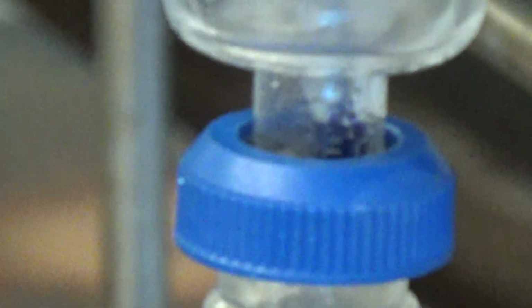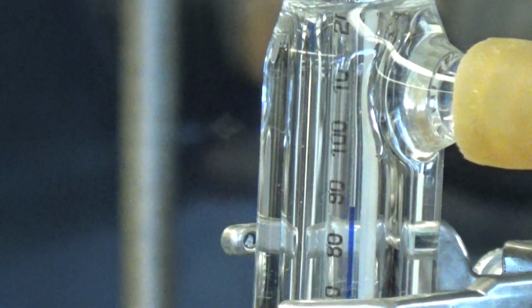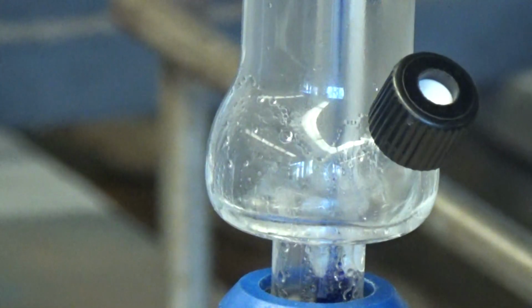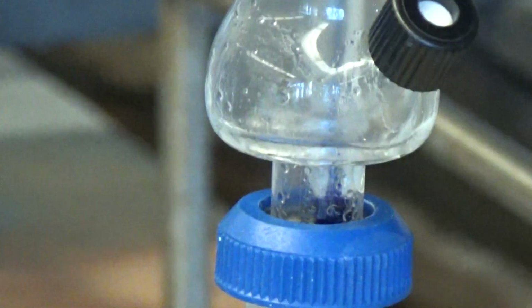All the pinacol has to dissolve too. So students will appreciate the way we do that. I definitely see product up top now. It's kind of sinking down there a bit. And the temperature now is about 87, something like that. 87 to 90-ish, almost 90. Once it does reach 100 degrees, you stop it? Yeah, we leave a little to have more liquid here. Cool. So there's your new product.